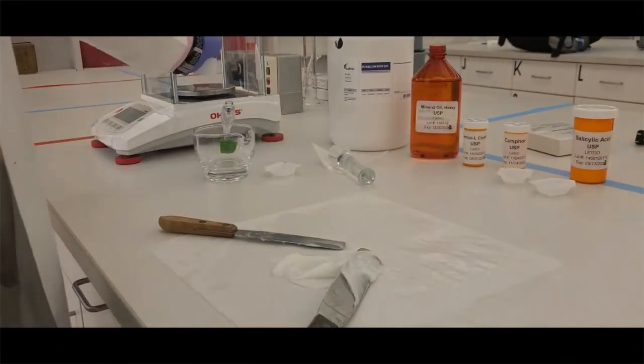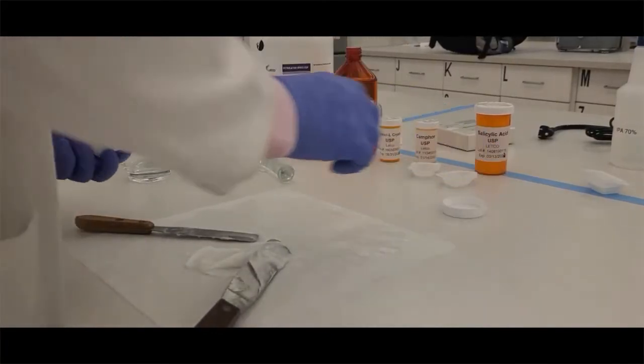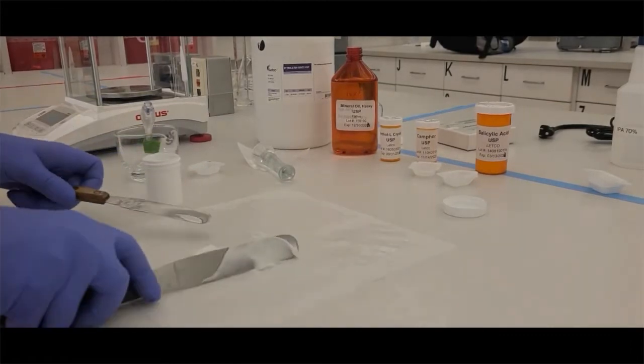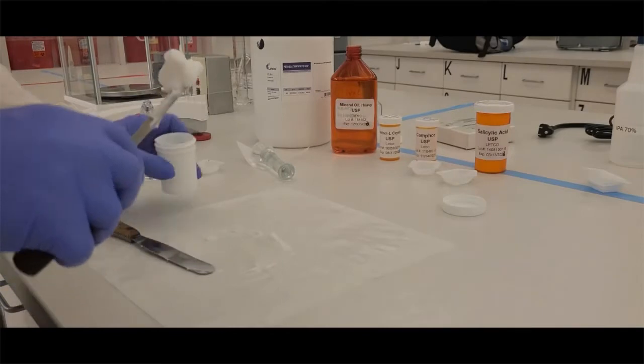And once you've got a nice uniform mixture, it should be a little bit of an off-white color, you're going to get your dispensing container. Now, mine's a larger dispensing container I'm using here. You may have a smaller one. You're going to weigh it empty. Once you've weighed it empty, your goal is to now place all that ointment into the container.